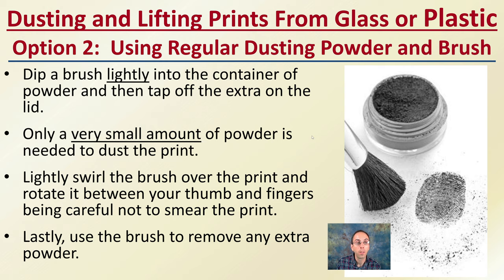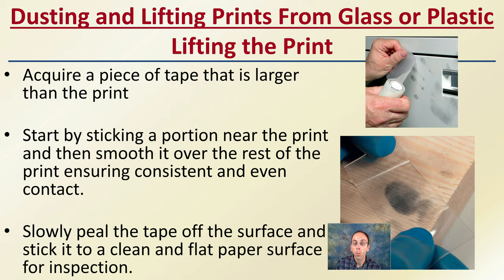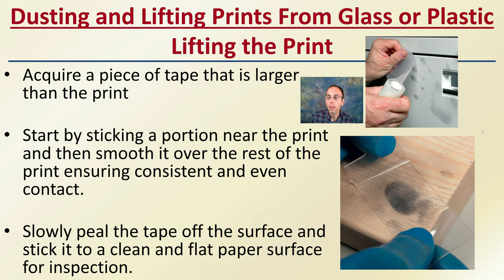Hopefully you'll be able to see the print become visible. Now you want to lift the actual print. You've dusted it and created a wonderful print — here we see a whole hand print, and here we see an identified fingerprint. To lift it, acquire a piece of tape that's larger than the print. Start by sticking a portion near the print and then smooth it over the rest of the print, so you're fixing it in one spot and smoothing it over without letting it shift or move. You want consistent and even contact. Then, after it's fixed, slowly peel the tape off the surface and take it to a clean, flat piece of paper for inspection. It's good to have that ready ahead of time so you can immediately go right to your paper.